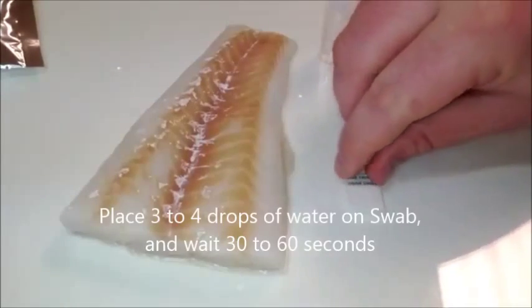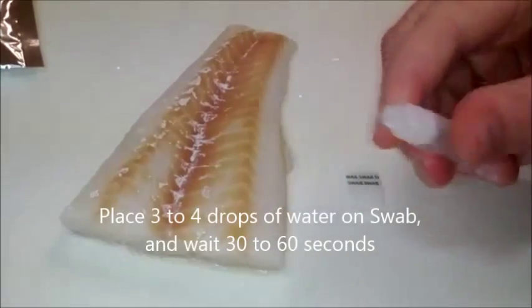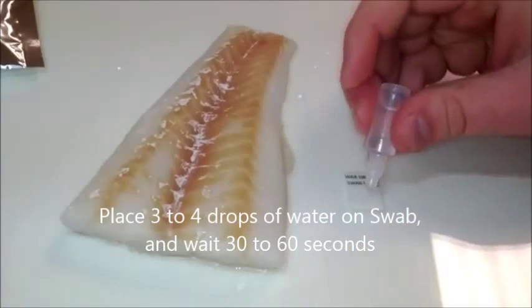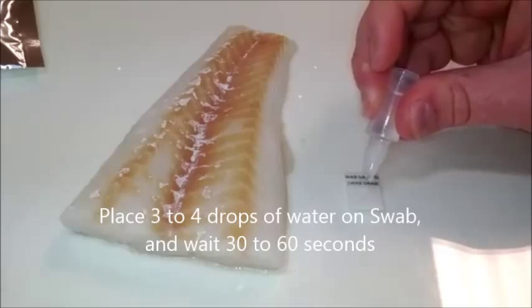Place the detector on a flat surface with the swab side facing up, place three to four droplets of water in the square opening, and wait 30 to 60 seconds.